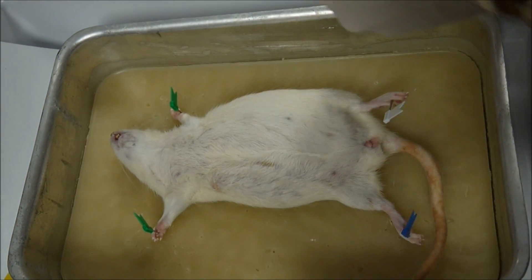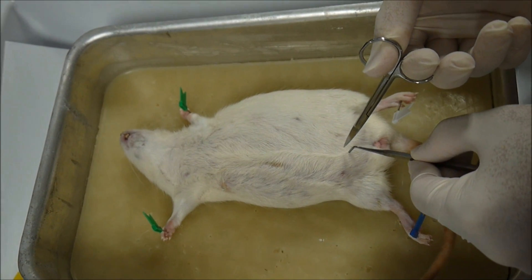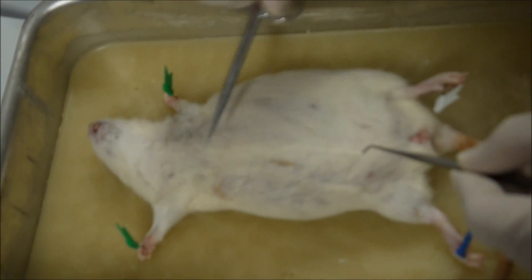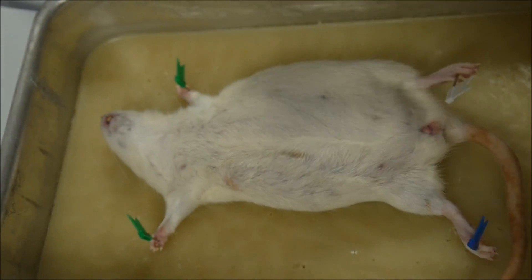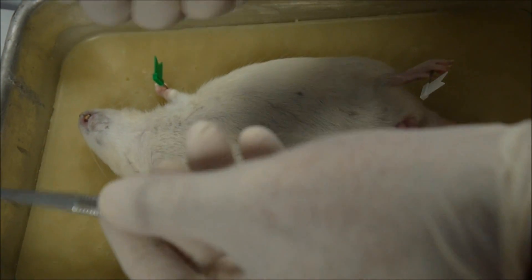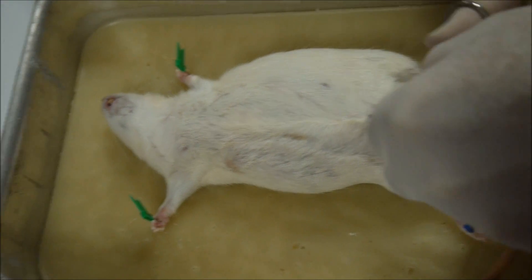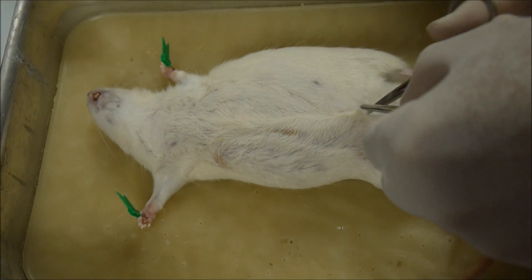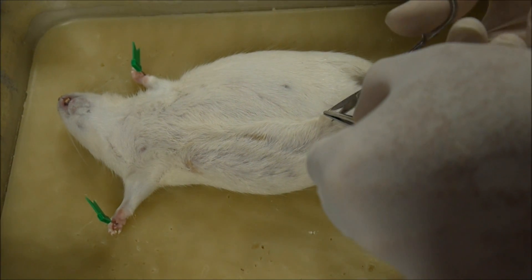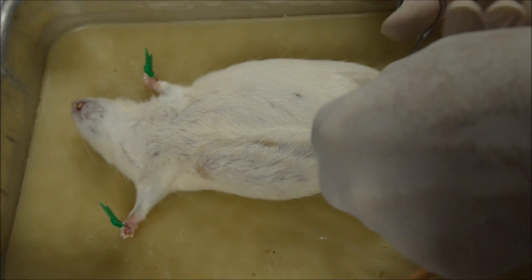Now to dissect the rat, we're going to start here and move up. You can also go up into the thorax, which is here. This is the abdomen here. Now get your forceps and the fine scissors. Can you all see? Lift the skin — we'll just remove the skin first, not the muscle. So you cut here. Do you have a blunt scissors? I've got the fine ones here. You know the big blunt ones?